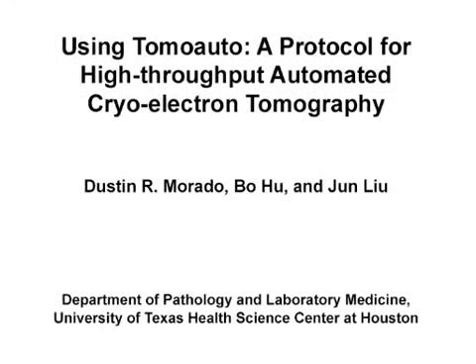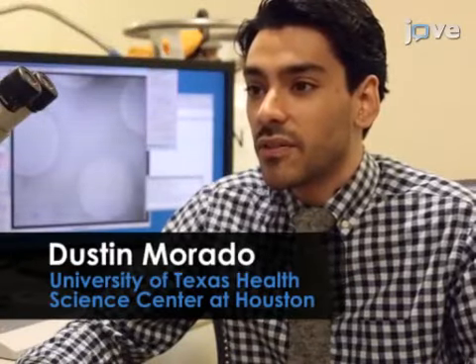The overall goal of this procedure is to help users establish a high-throughput collection and processing pipeline of cryo-electron tomography. This method can help answer key questions in the cryo-electron tomography field, such as how do I handle data collected with new generation detectors and process the huge amount of data produced by automated tilt series collection software.